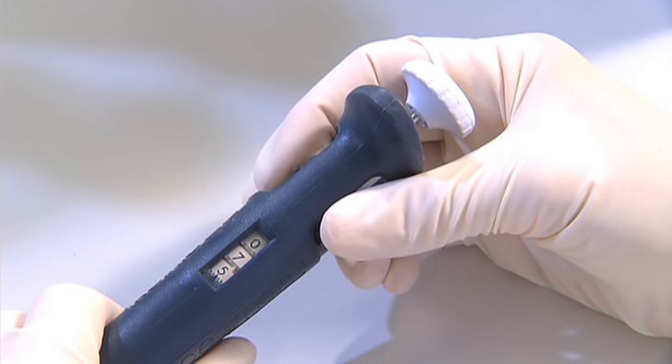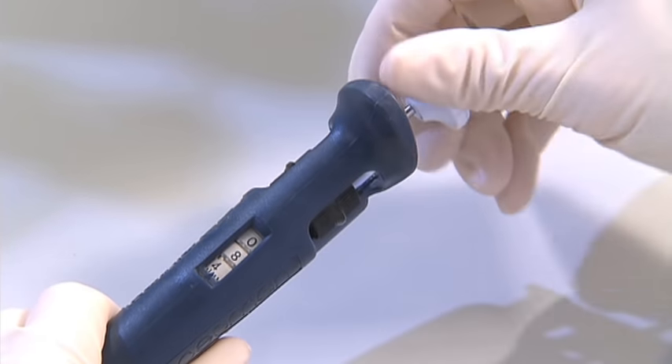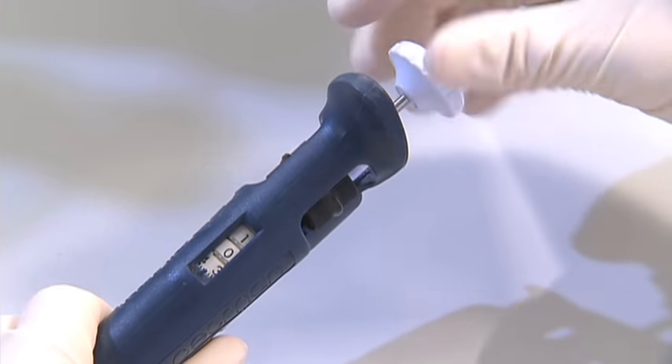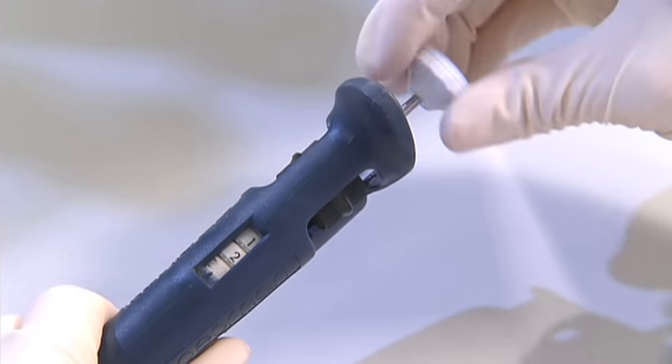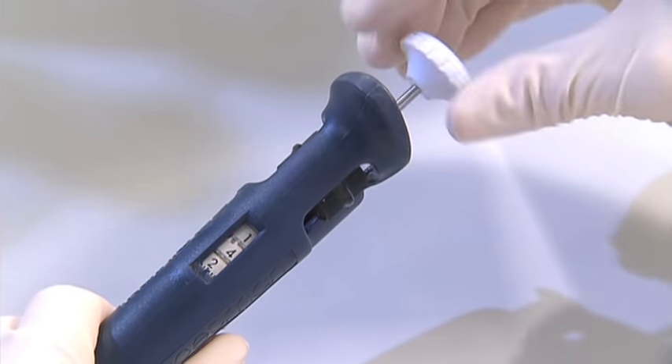Each pipette has a vertical row of three numbers visible in the body of the instrument. To set the volume, you can use either the thumb wheel or, on newer models, the push button. This will cause the three number dials in the body of the pipette to rotate and change the volume of liquid that will be taken up. However, the dial numbers indicate different volumes depending on which pipette is used.